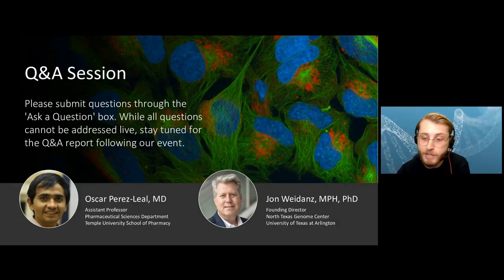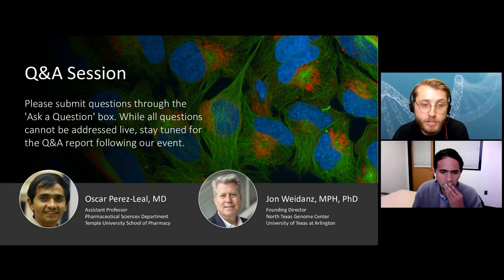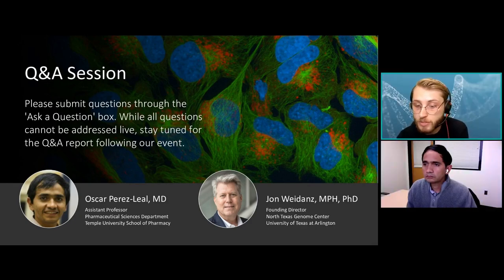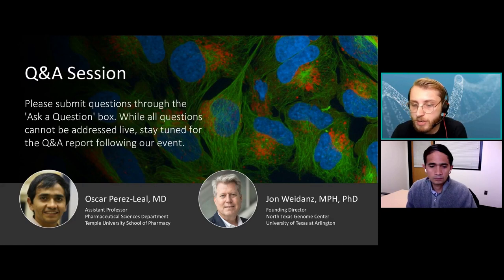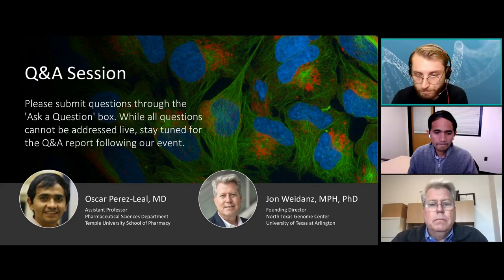Fantastic. All right. Well, big thanks to John and Oscar for the insight so far. So let's just kick things off with a great question here. How do you prevent the labeling tag from interfering with the function of the targeted protein?